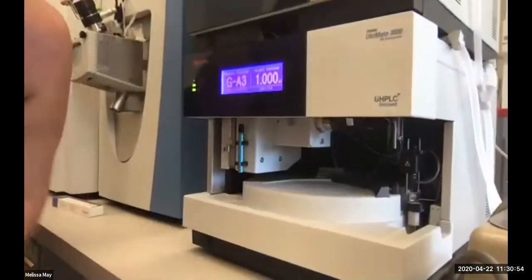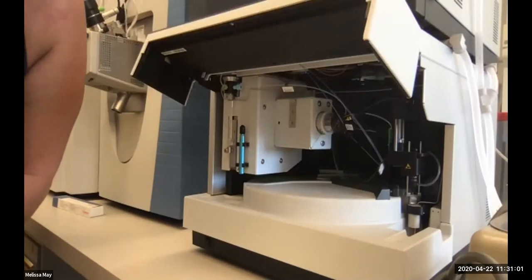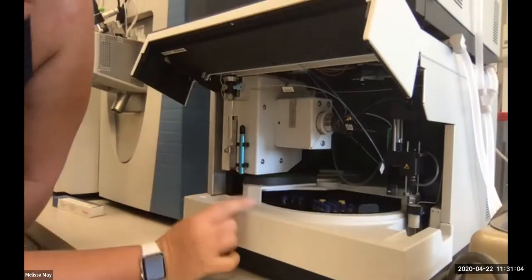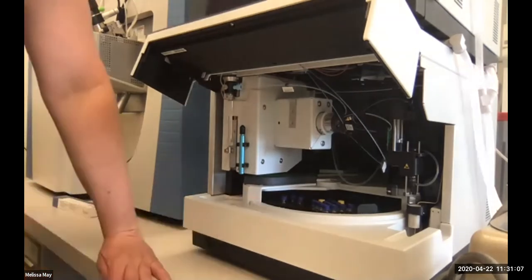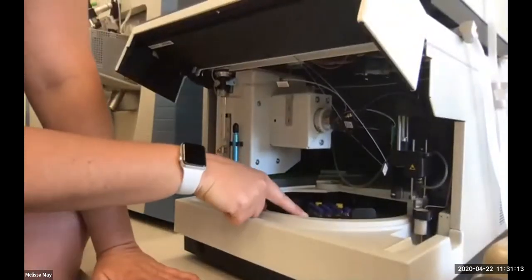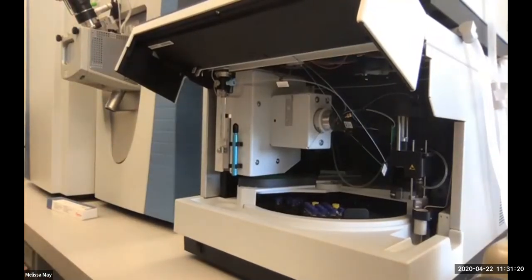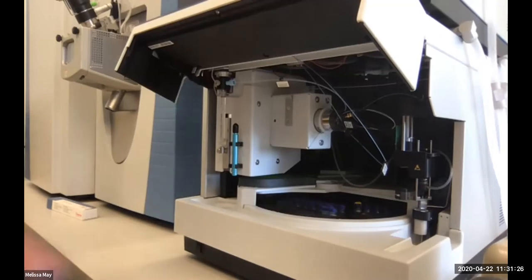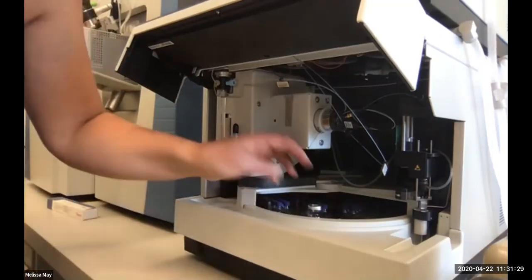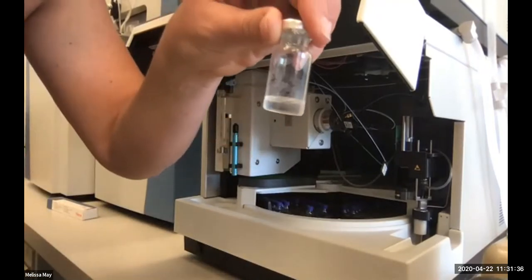Down here, let's try to put this on a stable surface, is where we have our auto sampler. If you flip this up, you can see that there are various different components of the auto sampler. We have our sample rack in here. Again, it's not very easy to see, but you have these trays. Actually, let me rotate. Okay, so you can see that there are these vials. These have our loading buffer in them, and you can see that I have that scribbled on here.